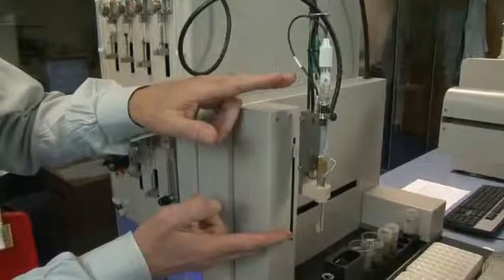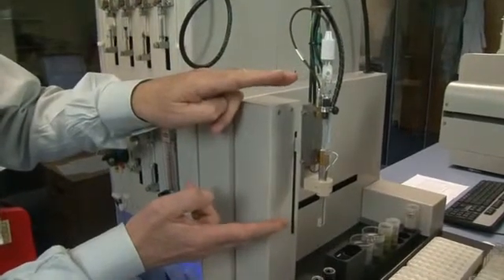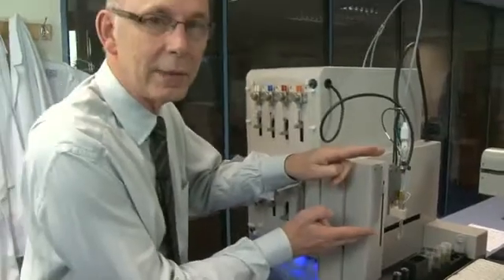This is the real heart of the technology, the thing that took us several years to develop. And in here is a lot of very important parts.